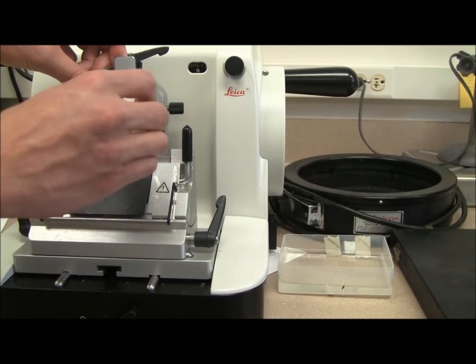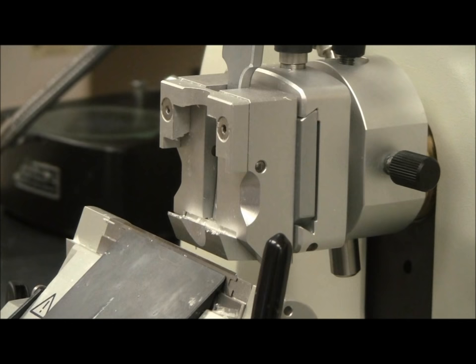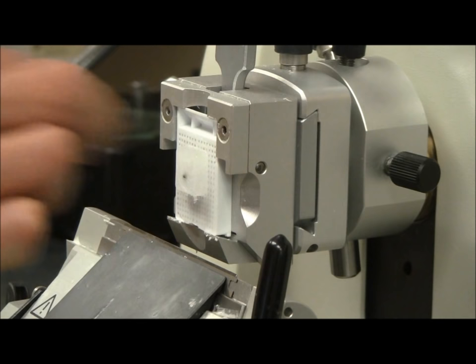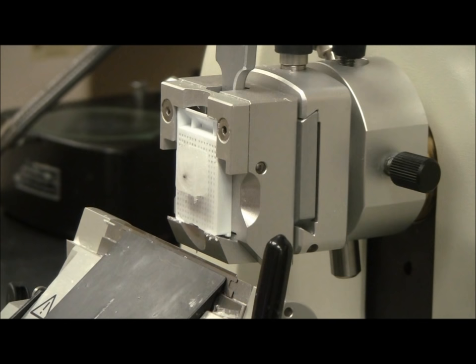Once the tissue is exposed, remove the block and place it in water. After 24 hours, reclamp the block and use a razor blade to cut away some of the extra wax surrounding your tissue. This will allow you to fit more sections on each slide.